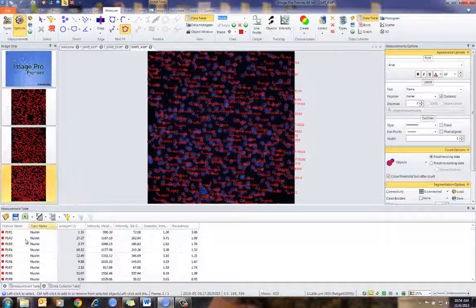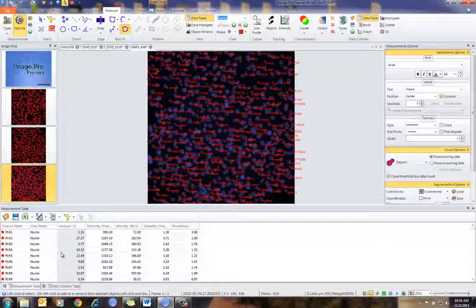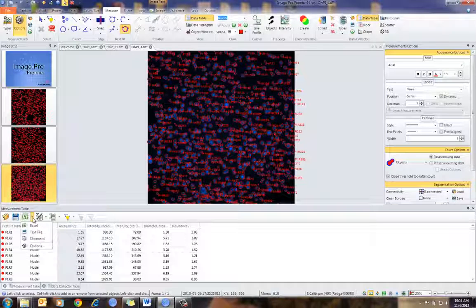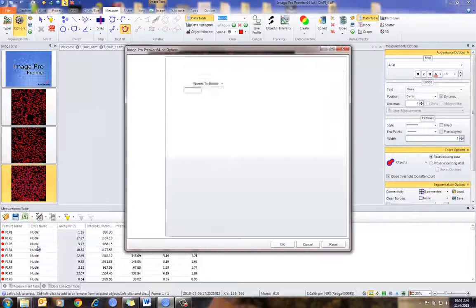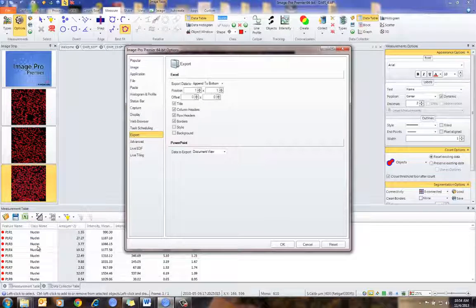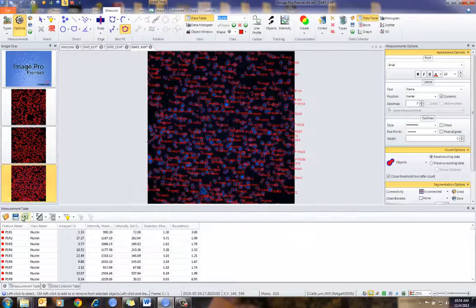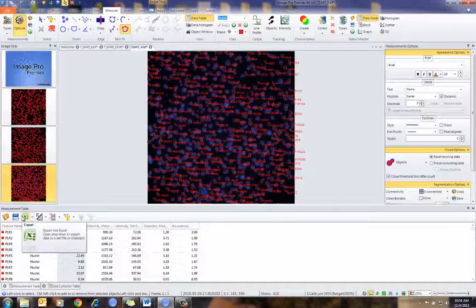At this point in Data Collector, I can do a couple of things. I can export this data by simply going to Excel. There are Excel controls here about how to send this information to Excel, and by pressing this button it will automatically export the data.